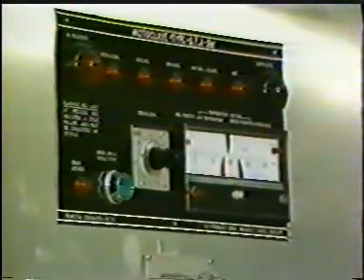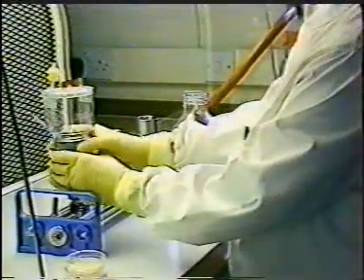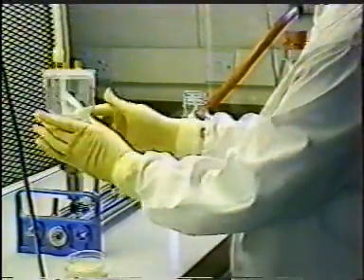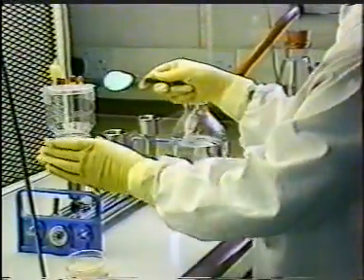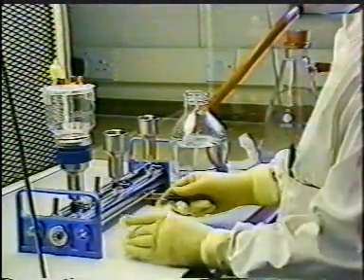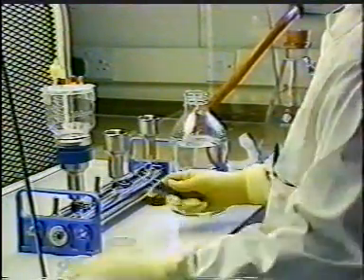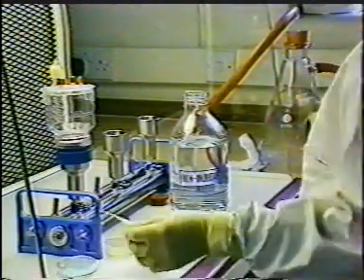Where a product is to be sterilized by heat in its final containers, it is desirable that the level of microbial contamination before autoclaving should be as low as possible. This is monitored by carrying out microbial counts on containers of the final product, which have not been autoclaved. Earlier steps in the process will also be investigated, and potential sources of contamination include the vessels used in mixing, the bottle washer and the bung washer, as well as the distilled water supply.